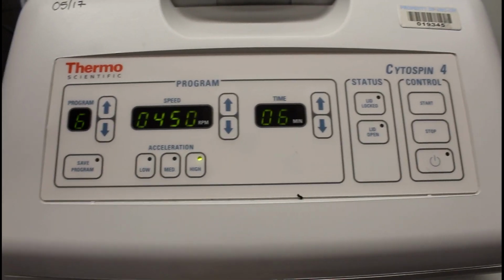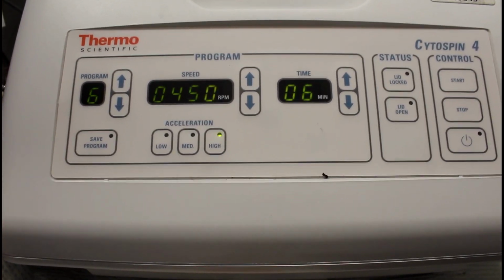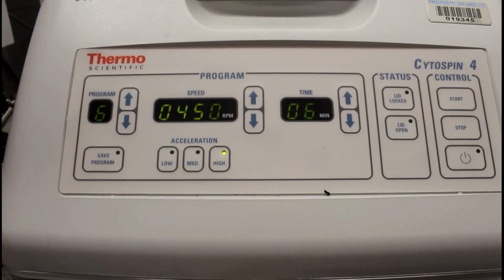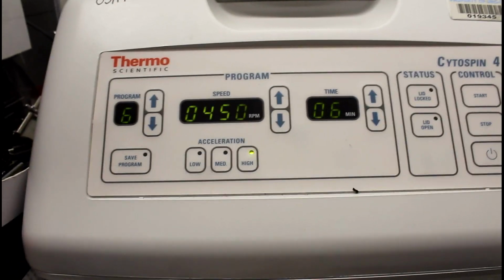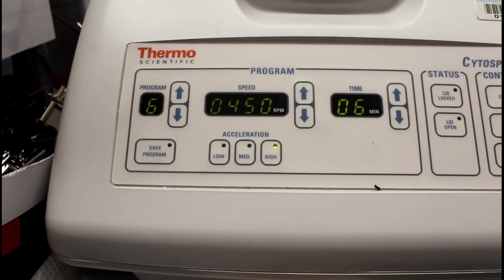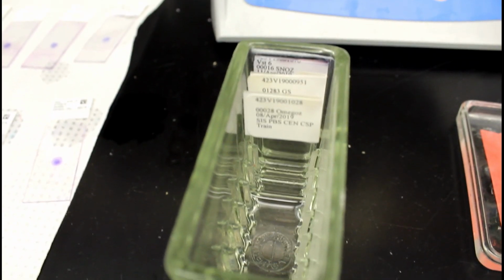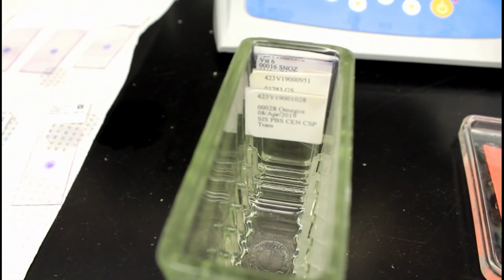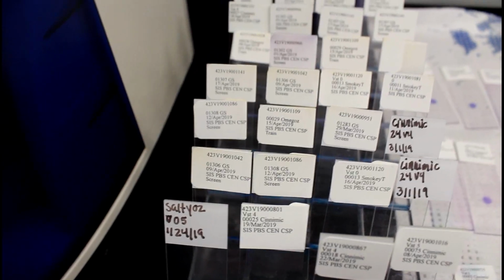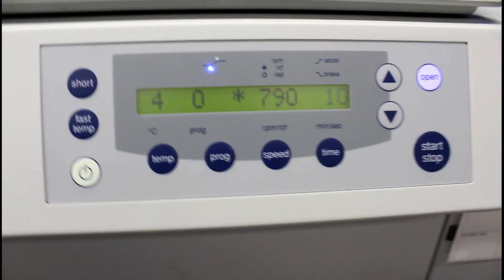The first slide you can use 60 microliters, the second slide you can use 70 microliters, the third 80, and the fourth 90 microliters. Each of those slides are entered into the cytospin centrifuge. After the 4 slides are removed from the cytocentrifuge, they will be fixed in 95% methanol for 10 minutes. Following fixation, the slides are allowed to air dry at room temperature for 10 minutes.